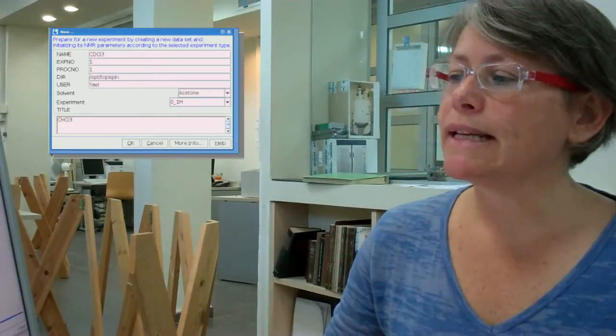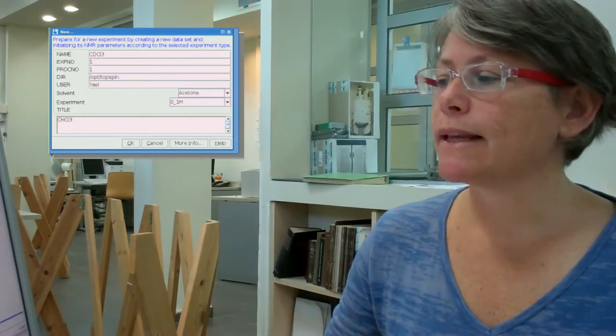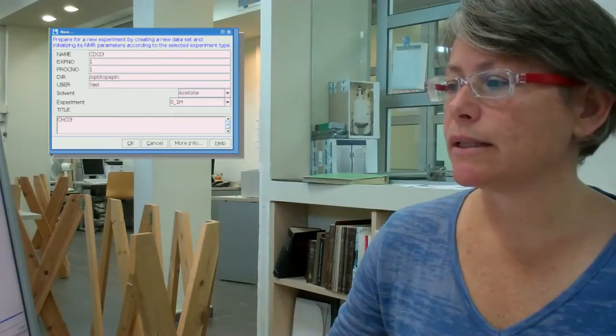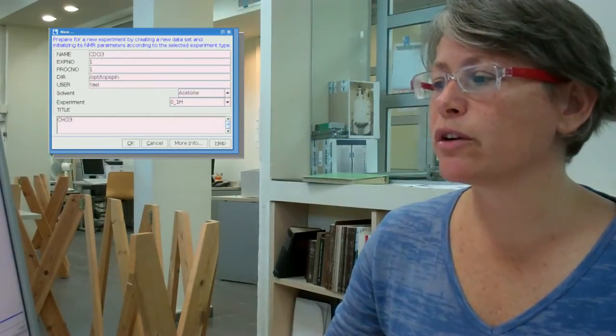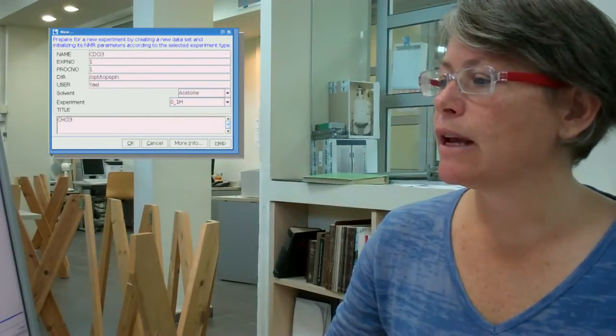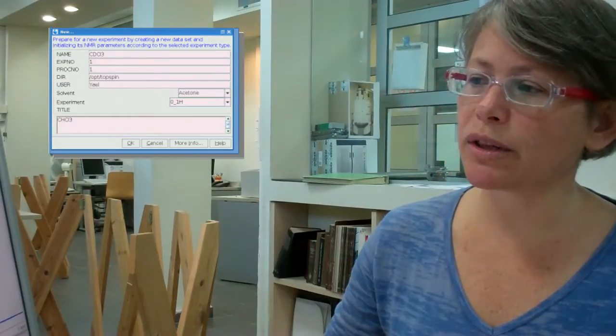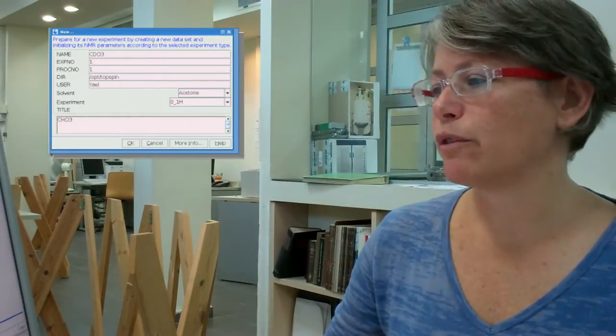And the directory is opt-topspin. That's because we're on a Linux instrument. The user here is generally your principal investigator, and it should be set up if you choose from the browser option on the left to be with the correct information.